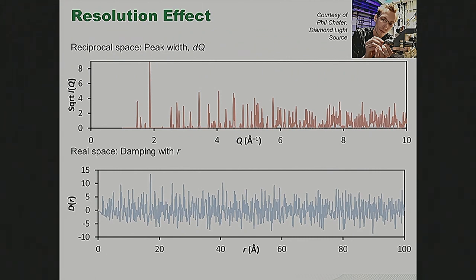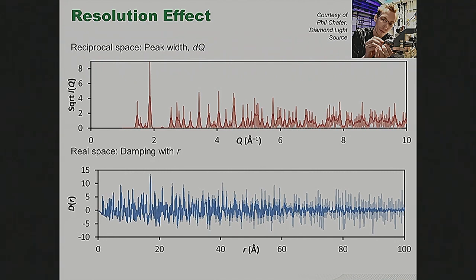So, all right, as this starts broadening out, you'll see that this function dampens more sharply, and so on and so on. So the intrinsic peak resolution you see at the amorphous area detector synchrotron PDF beam lines is much closer to this. And the resolution you find at our instruments here, Nomad or PowGen, is much closer to the high resolution there. So we have access to much higher real space ranges. That's a real strength of neutron total scattering studies. Of course, it's a lot slower.